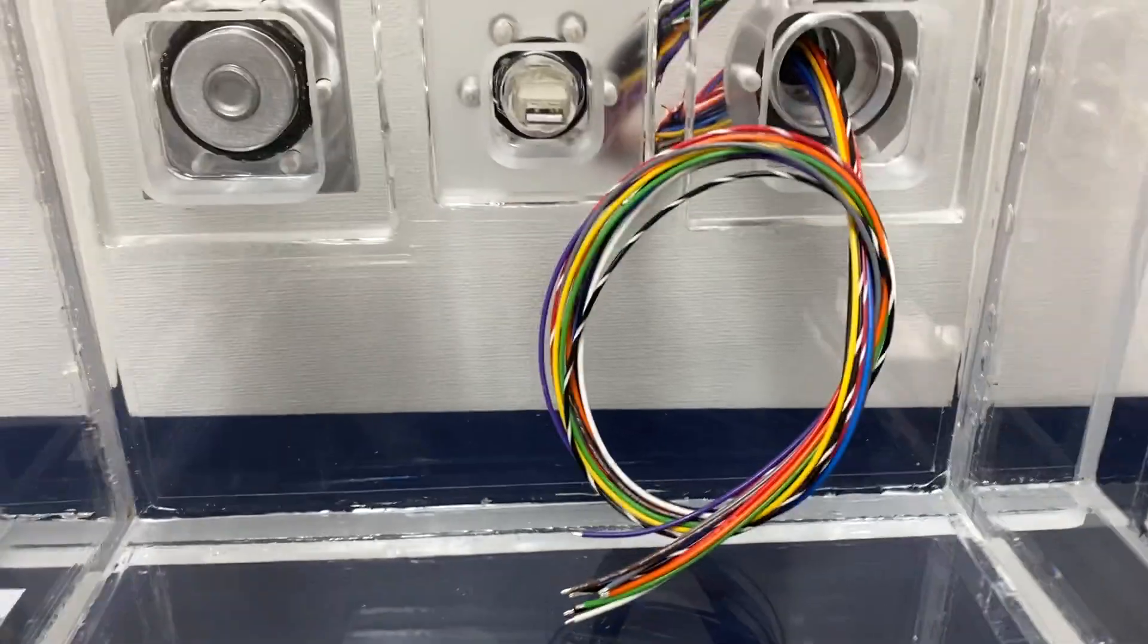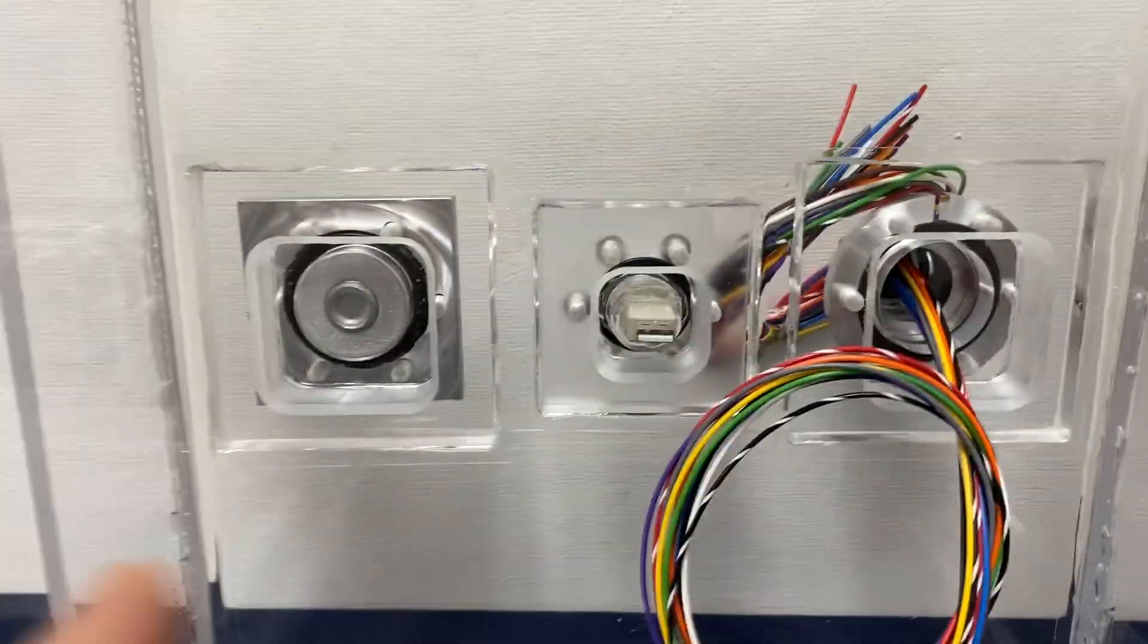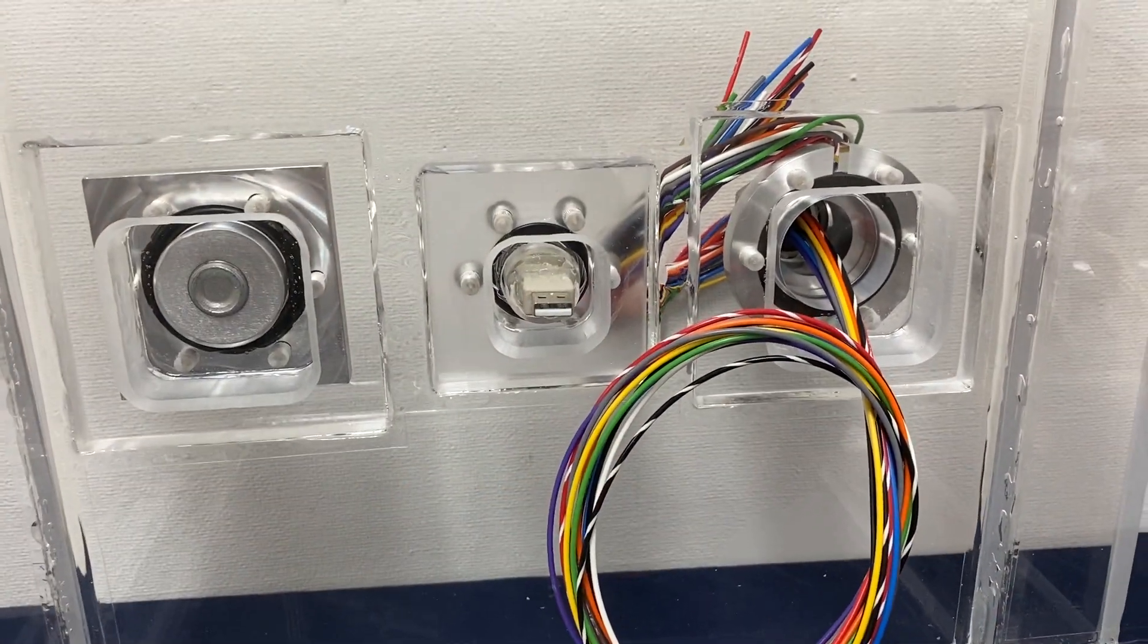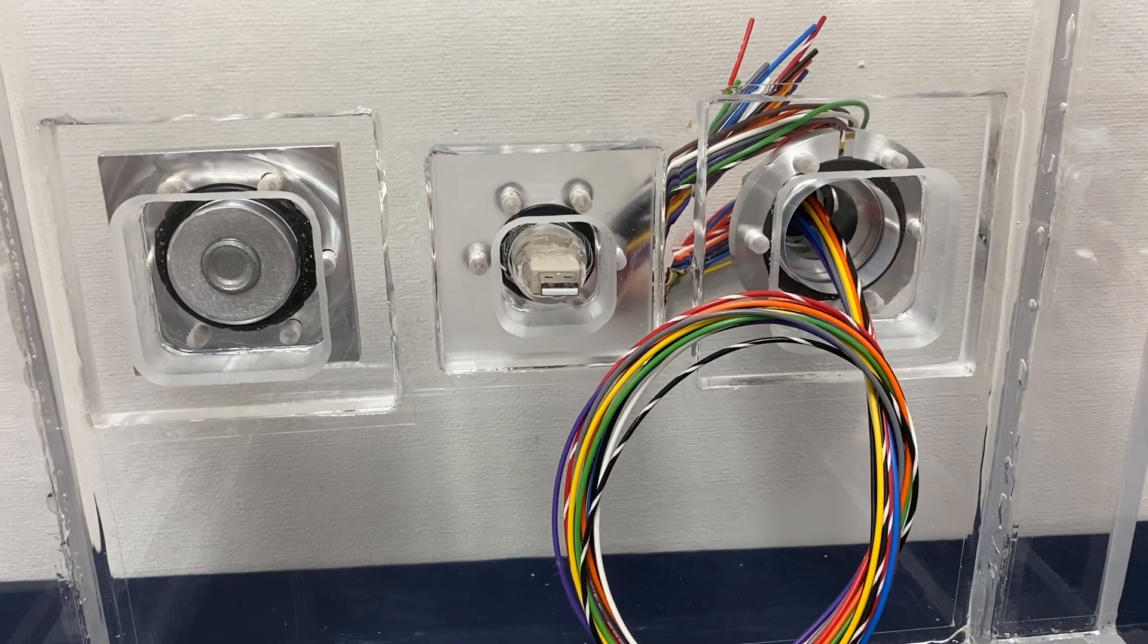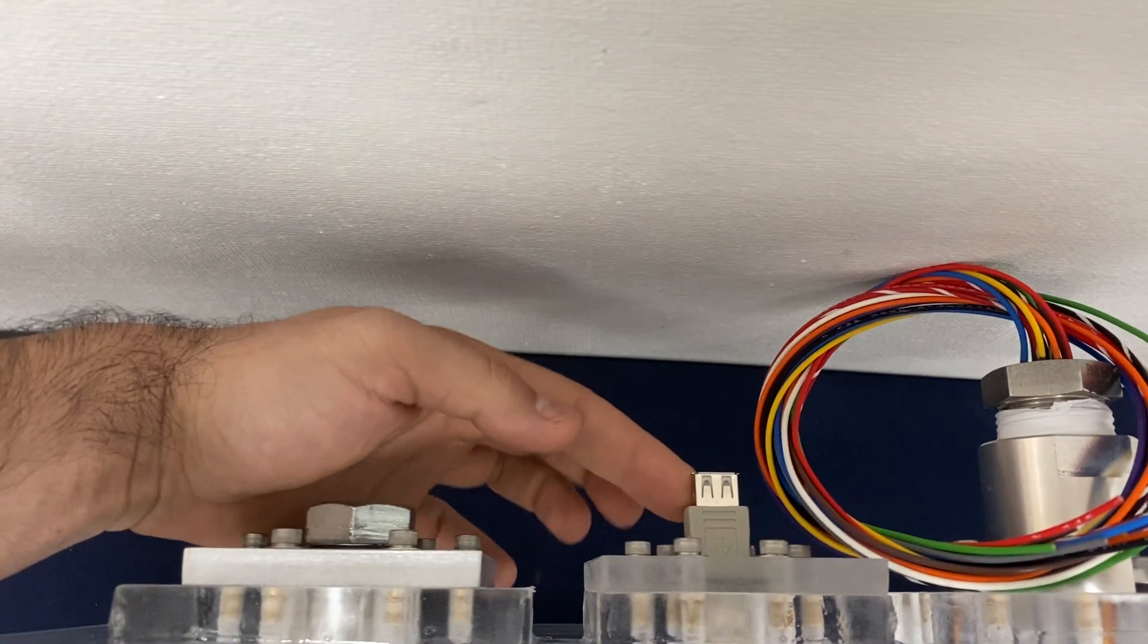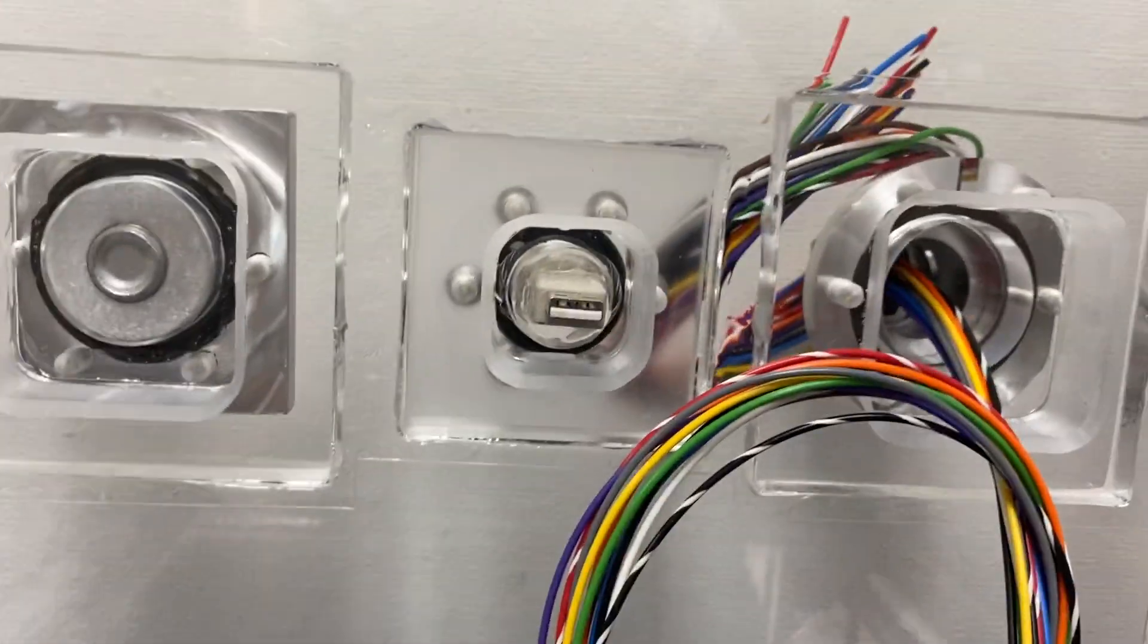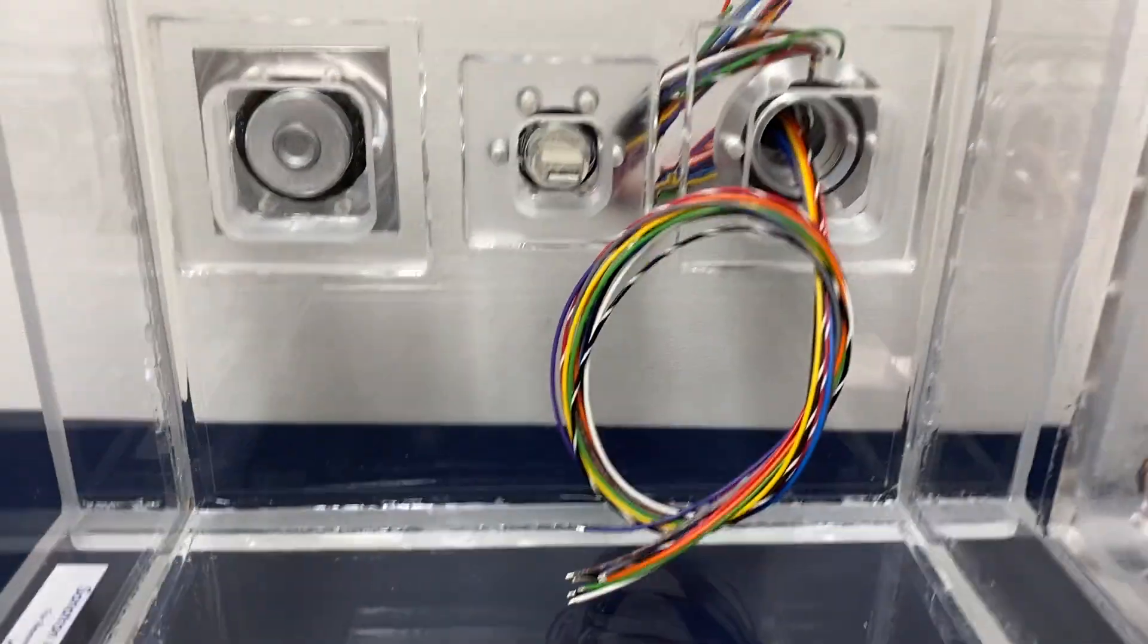The second feed-through is a USB feed-through. So essentially you can run your USB signal—you can connect it here on the outside and you can run your USB towards the inside without ever compromising the vacuum.